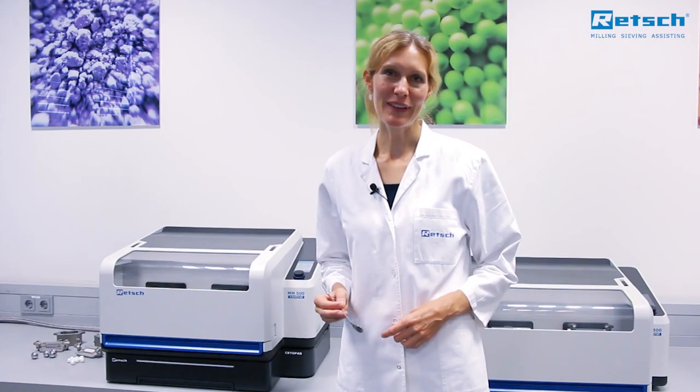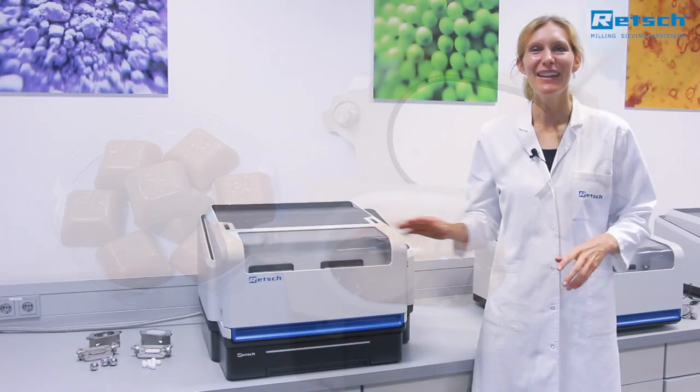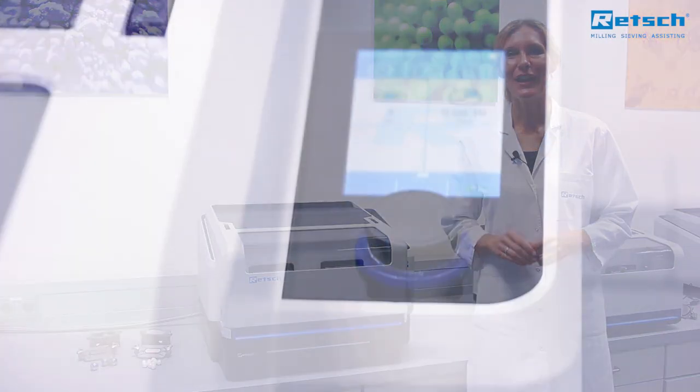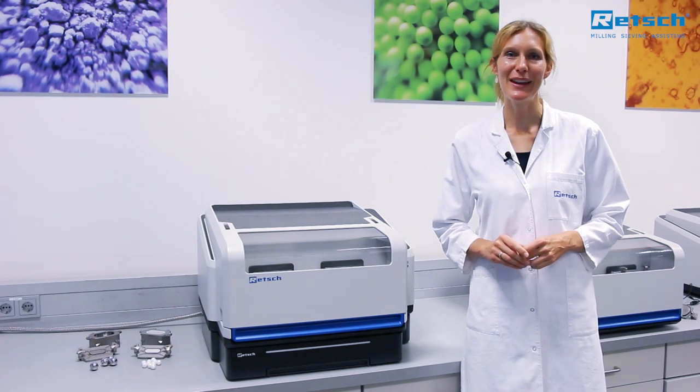You can even warm up your samples. The MM500 control allows you to monitor and control the temperature during the grinding process.